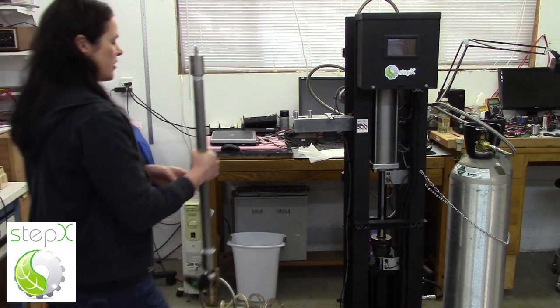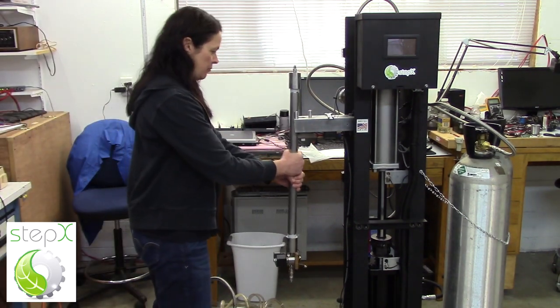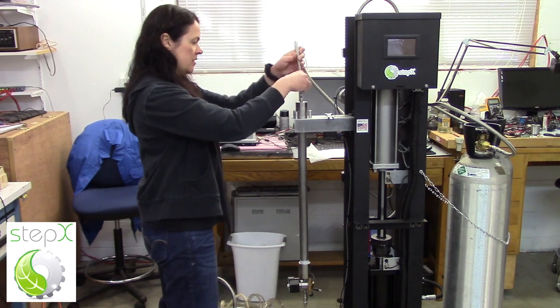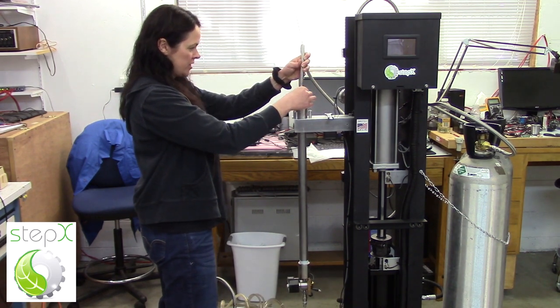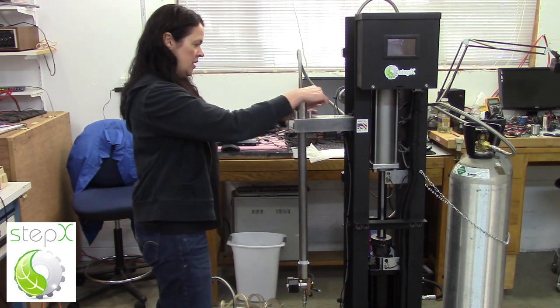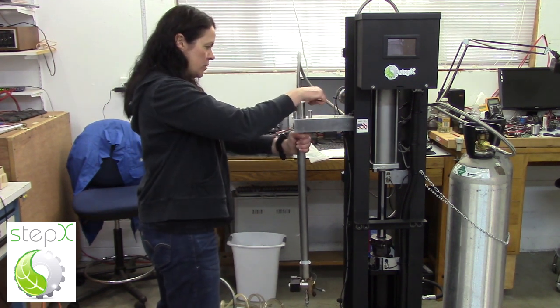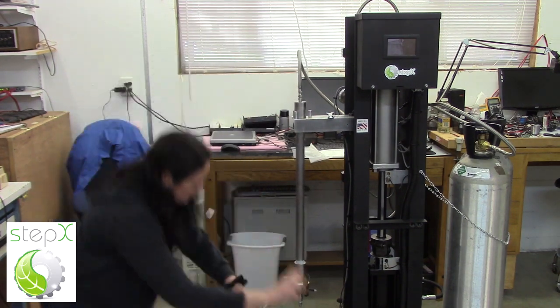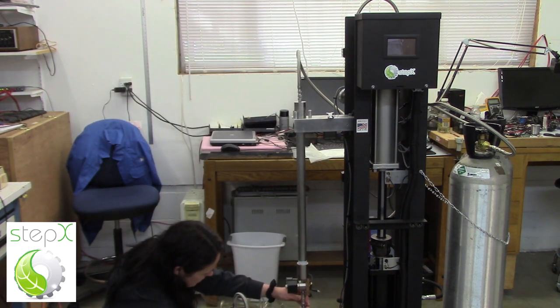Now that we have material in our reactor vessel, it's time to mount it on the compressor. I hang it here and attach the hoses. This stainless steel hose comes from the compressor into the reactor. I can finger tighten it, then use a wrench to tighten it up a little bit more, then I go from the collection vessel to the sublimation valve in the same way.